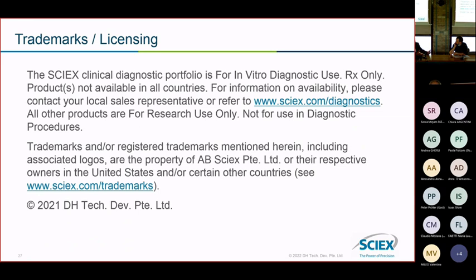So this is a new box that comes to the market. Another thing that your previous boss openly commented on is why he was first interested in the Zeno TOF, which was for the intrascan dynamic range, which goes back to that MS/MS approach. How do you know my previous boss? Because if it's the one bragging about EAD, maybe he's the one bragging about the dynamic range too. Maybe he does it publicly.